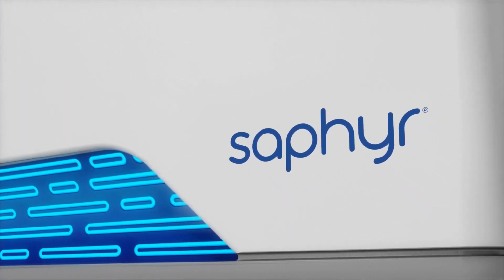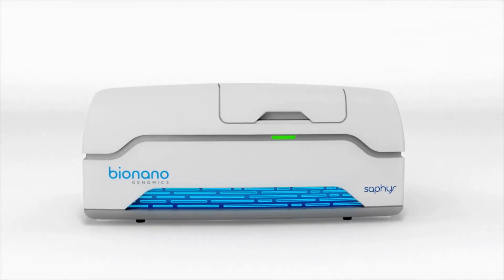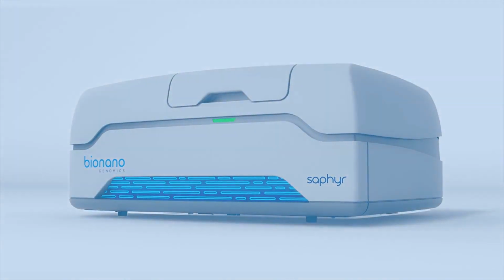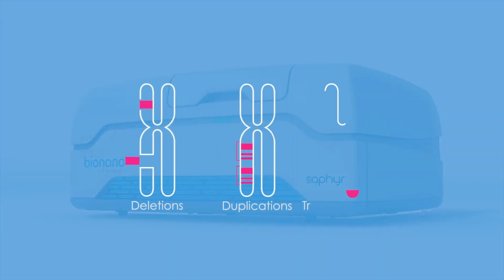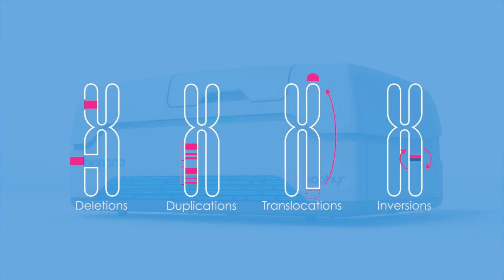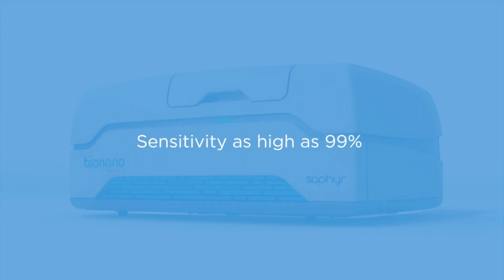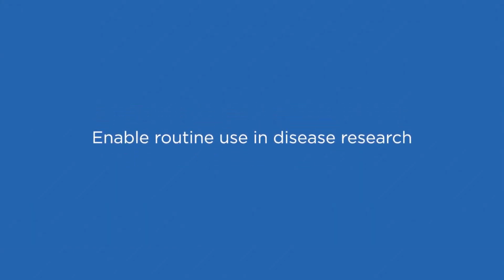This is Saphyr from Bionano Genomics. With it, you can directly image the genome at high resolution to detect variations such as deletions, duplications, translocations, and inversions, known as structural variations, with sensitivity as high as 99%. The process is simple and automated to enable routine use in disease research.